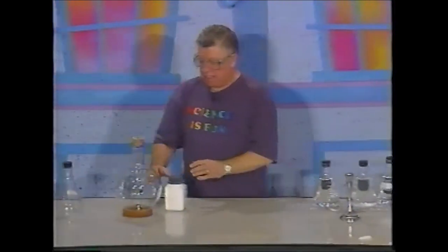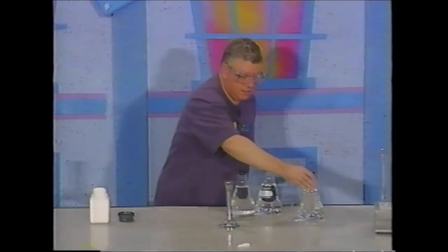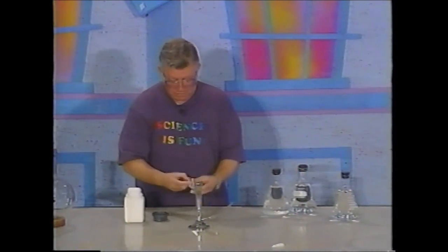I'm going to do an experiment now with another element in the periodic table which is not metallic. This is the element sulfur. And to do that, I need to reignite this burner, because what I want to do is burn solid sulfur.